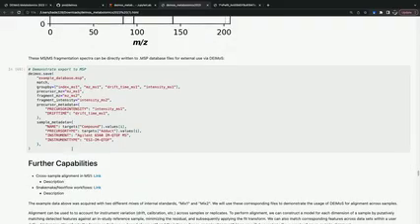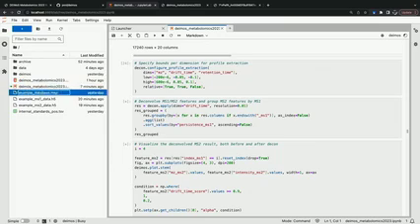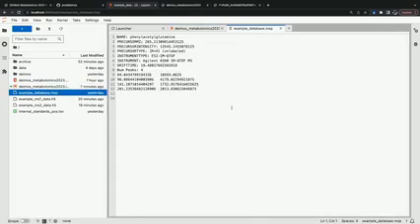Here, we've included as part of the included data files an example MSP, and this corresponds to that feature that we demonstrated in this workbook, and it'll save in MSP format, which looks approximately like this.